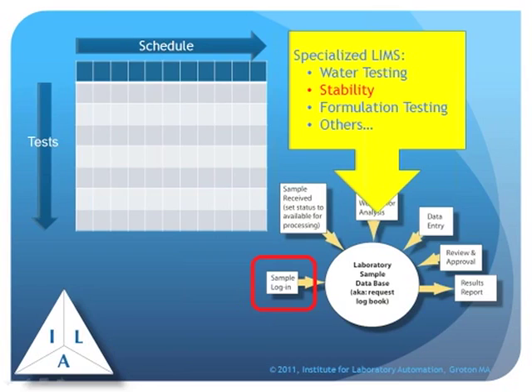And in most LIMS systems that are not specialized, every sample would be logged in individually. And you'd have to keep track of which samples were tied to what sample IDs. With a stability testing system, it'll do all of that for you. You lay out the program, it'll identify the samples, make sure things are well organized so you can work with the data and take care of it for you. So that's just one example.